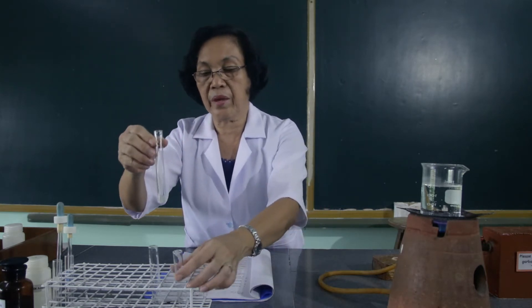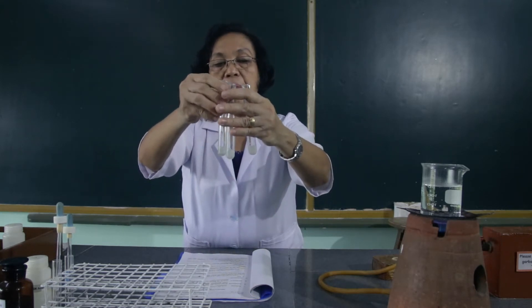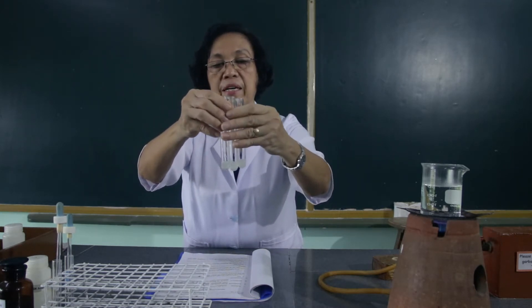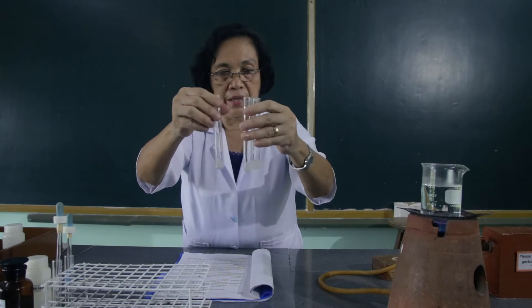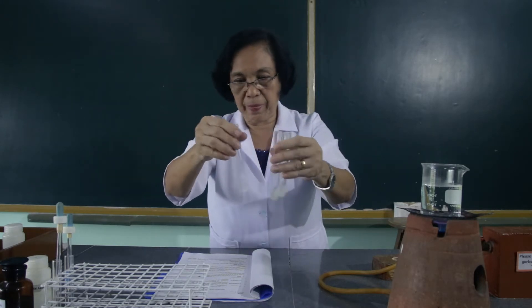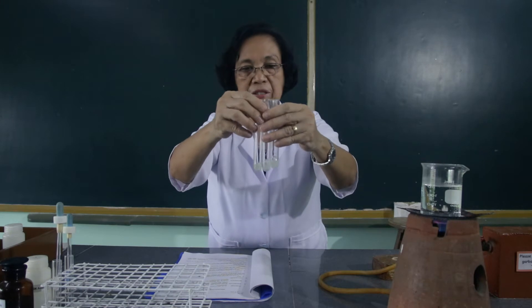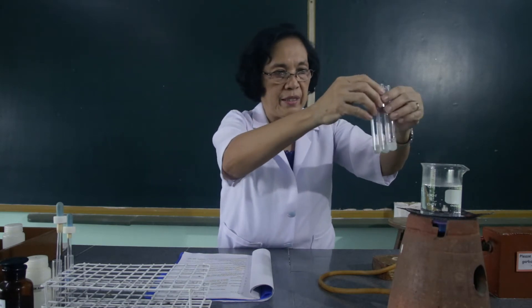The third test tube will serve as our control, so we will not add anything to the third test tube. With these three test tubes, we will place them into the water bath to heat it and boil them.